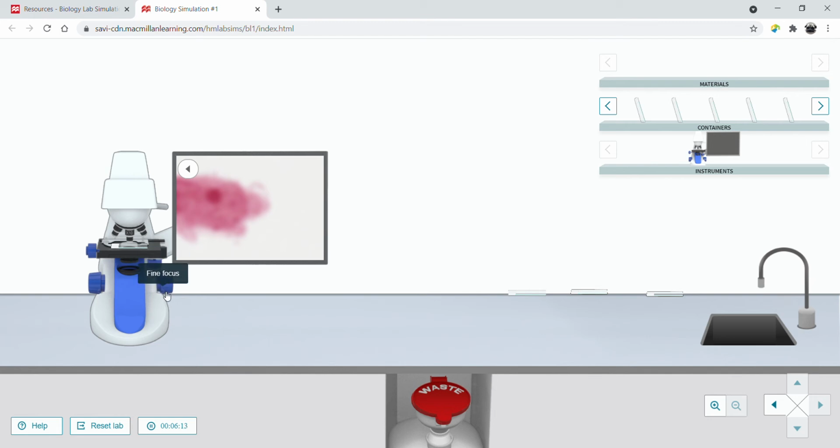Now I'm doing the things you would do if you were actually signed in and doing the... There we go. It's a little frustrating. I have a pretty good internet connection, but I think it really wants you to mess around. Notice how I'm taking responsibility off of me. Yeah, it just kind of went out of focus again.